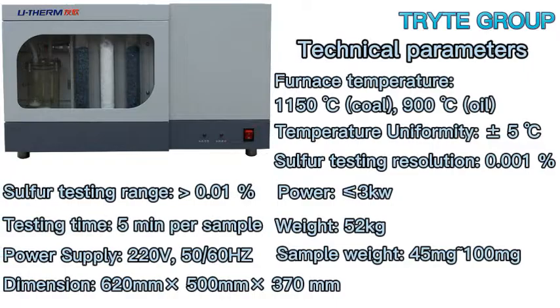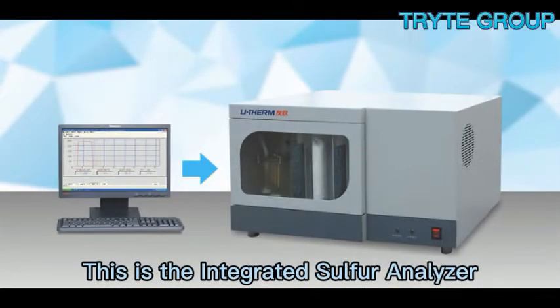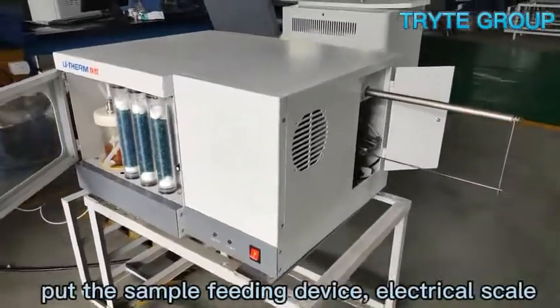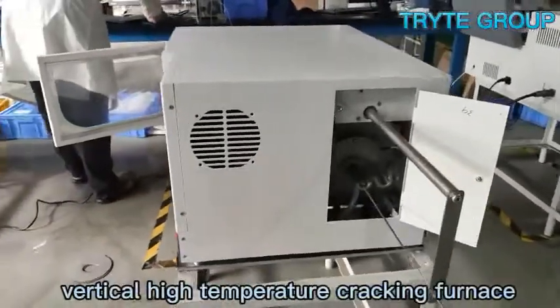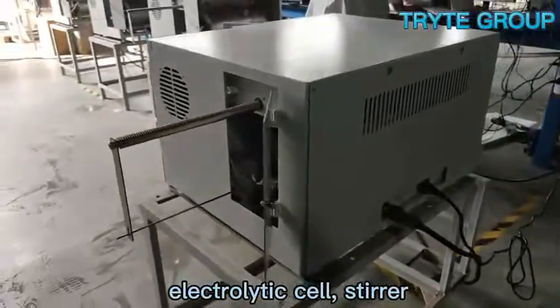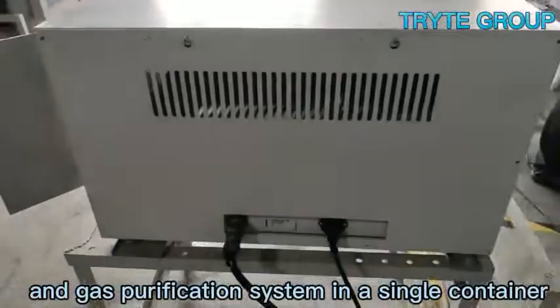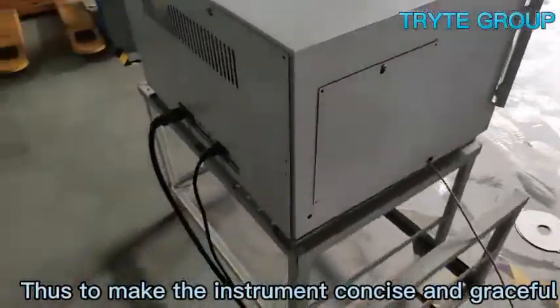Hello, everyone. This is the Integrated Sulphur Analyzer, adopting the integrated configuration, with the sample feeding device, electrical scale, vertical high-temperature cracking furnace, electrolytic cell, stirrer, and gas purification system in a single container, making the instrument concise and compact.